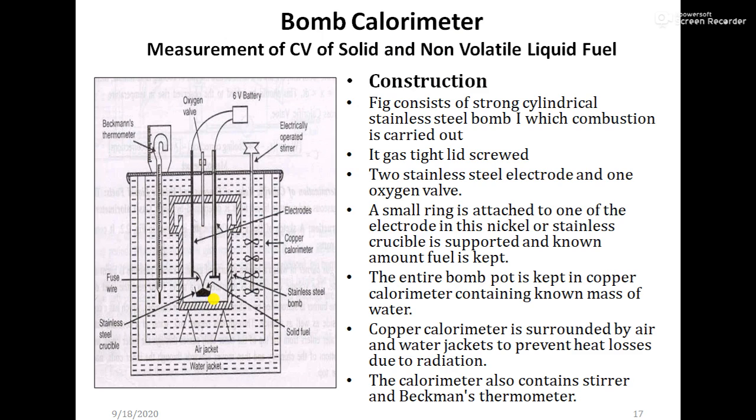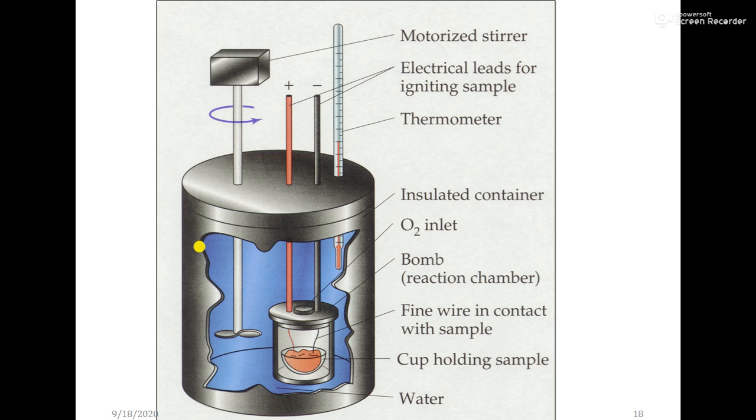For combustion we require oxygen. So this is the oxygen valve, or the screw-tight lid. You have to fill this bomb pot with oxygen at 25 atmospheres.